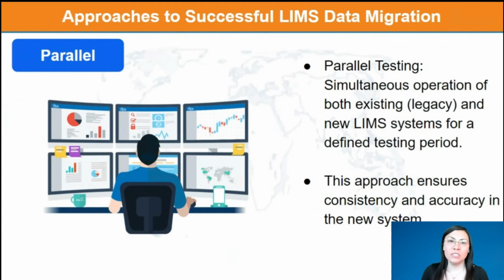However, we have to consider that it will be a longer process because you are maintaining two different systems simultaneously. And also you have to have the capability in, for example, analytical instruments, to support both systems. It will also be more expensive because you will need the IT infrastructure to support both systems. So if an error occurs in the current LIMS or in the new LIMS, you will have to have the capability to support this new system and the old one as well.